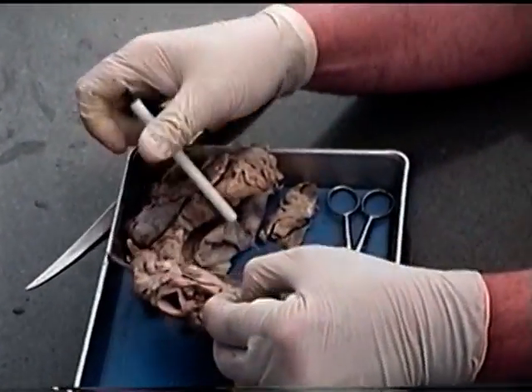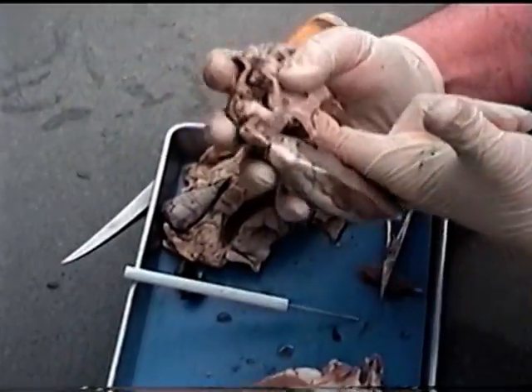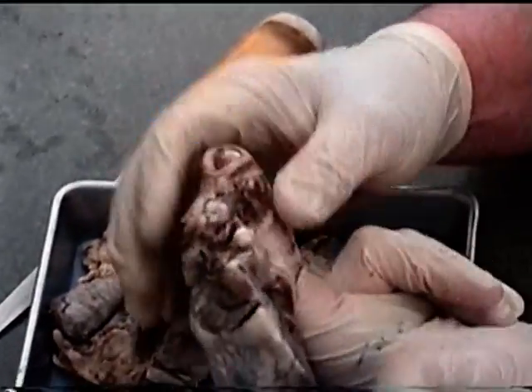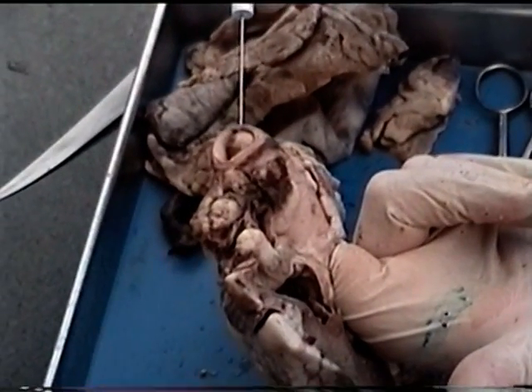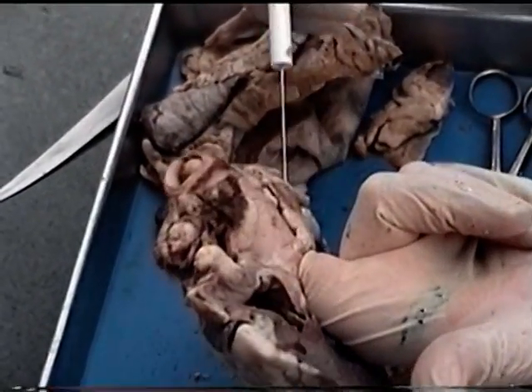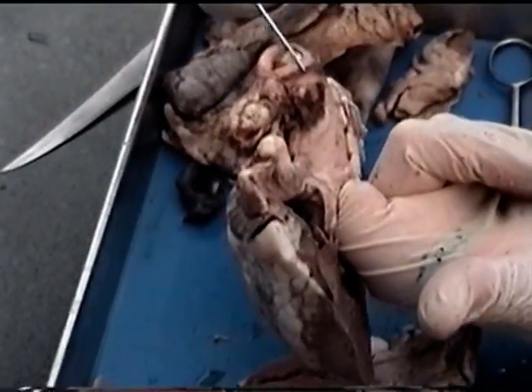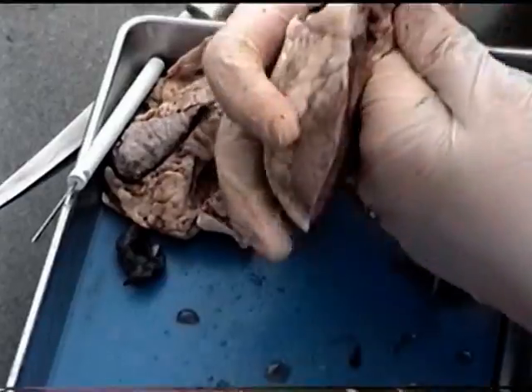Now, if I look at the left side of my heart, then I should be able to stick my finger through a blood vessel, and my finger will come out of this really big blood vessel that we had identified as the aorta of the heart. And so it's coming out of the left ventricle here, and what we're looking at is the ascending aorta, and they cut it where it would be the aortic arch, where it would have been connected as well.